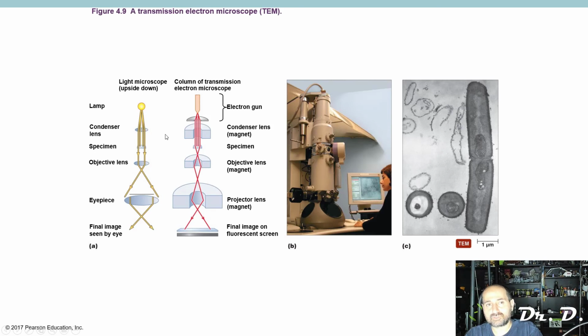Let's start with a transmission electron microscope, TEM for short. What is a transmission electron microscope? This is a picture of one. You see how big they are? This here is a vacuum chamber where you suck out all the air.